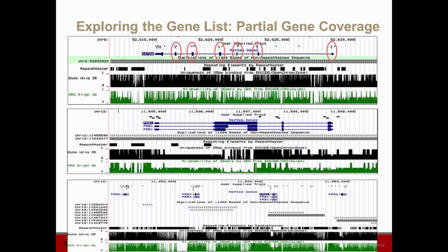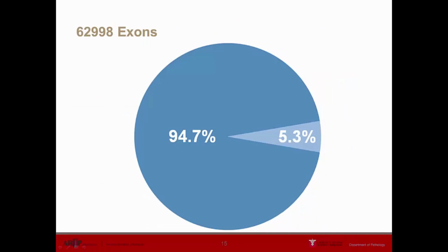So a total of the 36 and then 94 genes that we didn't have coverage at a 70% or greater level of the exons. Really just 130 genes out of those 4,600 targeted genes didn't meet our criteria. So 97% of the genes had that excellent depth of coverage that was shown at the beginning for the ACTA2 gene.